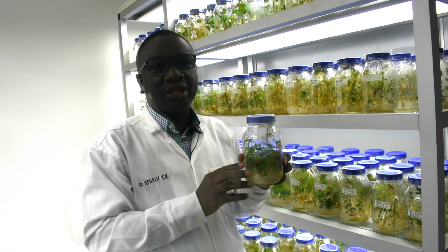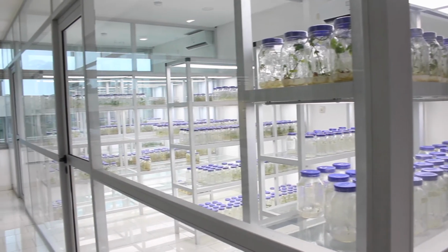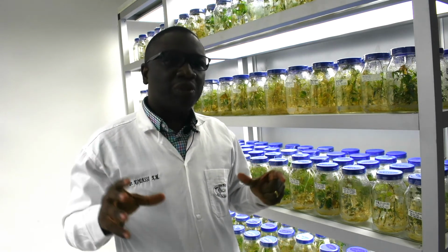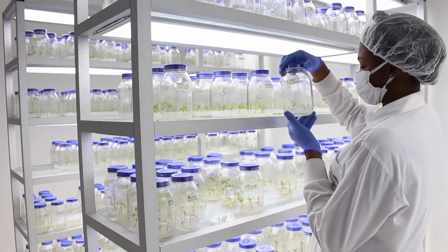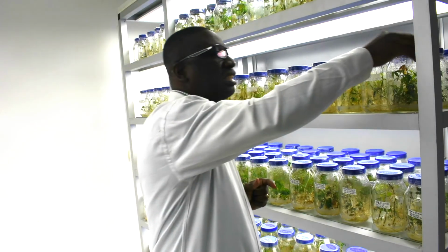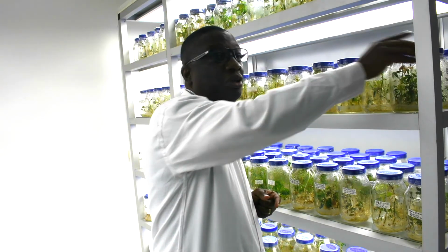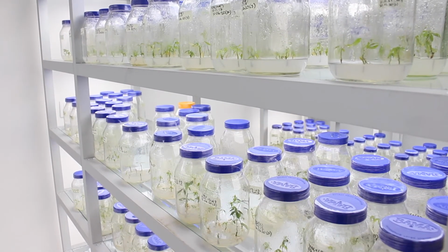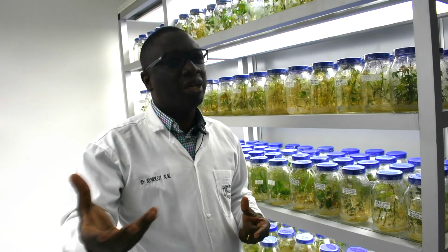Here we have 5 growth rooms, and all these growth rooms can contain 9,000 of this type of container. So if you do the calculation, at once we can have 90,000 plants. So we have this big capacity, this ability to provide planting material to the farmers.